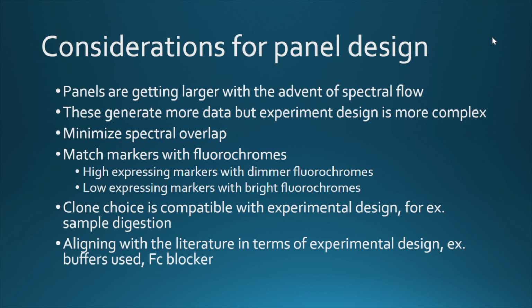There are quite a few considerations once you set a given list of markers that you're interested in phenotyping. Which fluorochromes are you going to choose? You need to choose a combination that minimizes spectral overlap, essentially maximizes resolution, maximizes what you're able to read off of each different marker or antigen that you are interested in biologically. So there are quite a few metrics, and again, I'll go through the EasyPanel quality score. But if you're talking about spectral cytometry, you might want to minimize complexity scores and similarity scores and optimize your hotspot matrix.